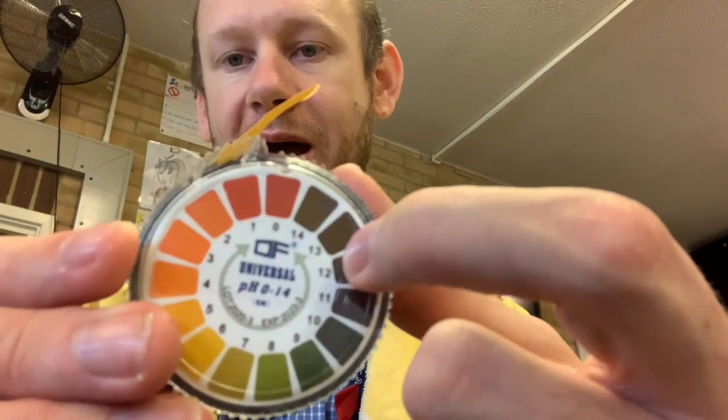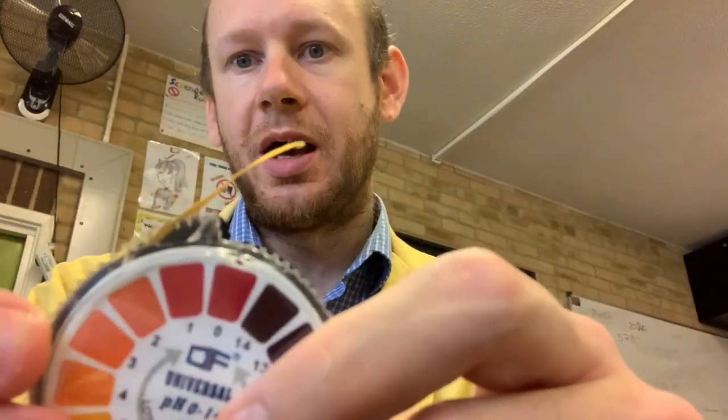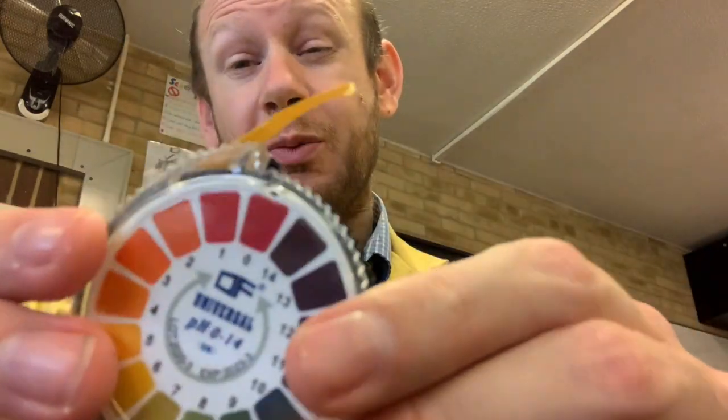We're going to use universal indicator paper, or pH paper, to work out whether or not it's strongly acidic or weakly acidic, strongly basic, or weakly basic. And we're actually going to get a number for the pH. You can see here on the side of my universal indicator paper that there's a colour wheel that goes from red through to orange, yellow, green, all the way to blue and purple. And this will tell us how acidic or how basic it is.